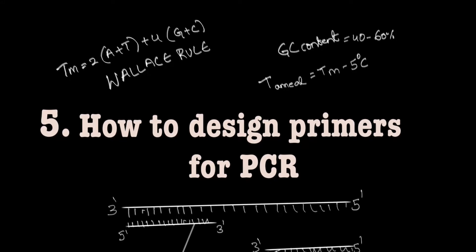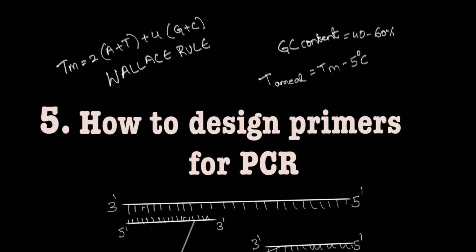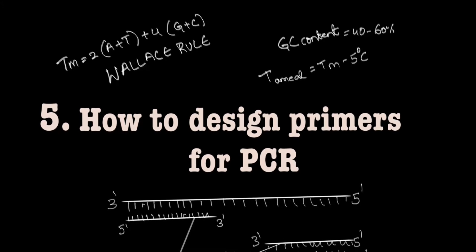Hello everyone, today we're going to learn how to design primers for PCR.